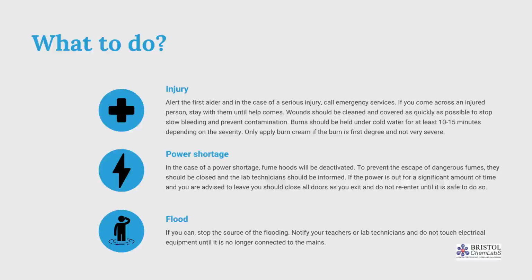In the unlikely event of a flood, if you can, stop the source of the flooding. Notify your teachers or lab technicians and do not touch electrical equipment until it is no longer connected to the mains.